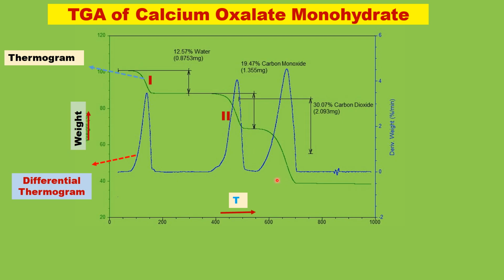Okay, and there is a third thermal decomposition process due to drastic mass change. In the first step the mass change is less, the third step mass change is large. For example, you see the area under the curve 1 is small because the mass change is small.